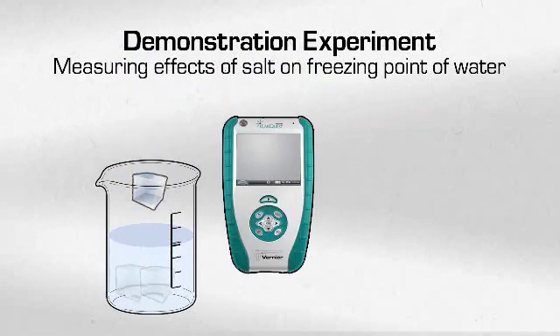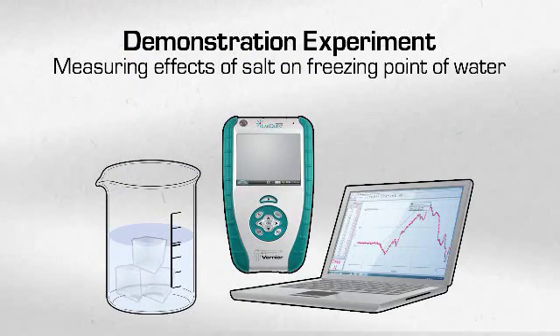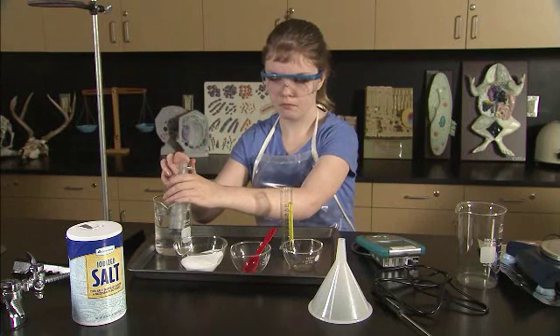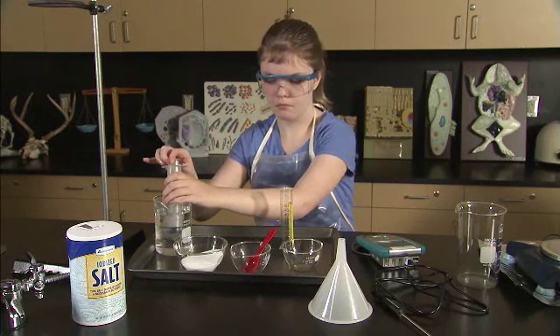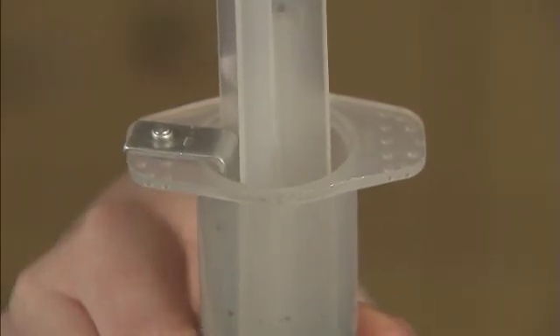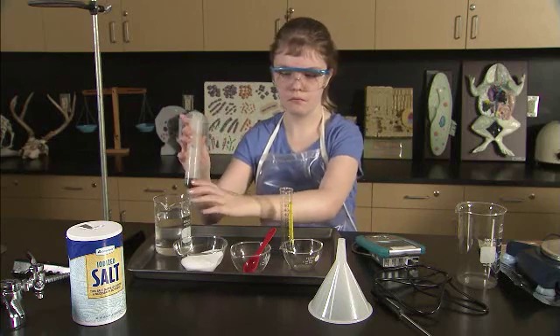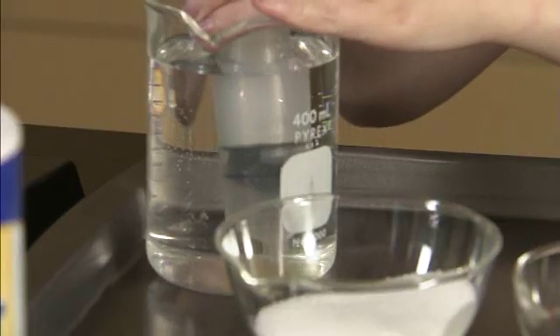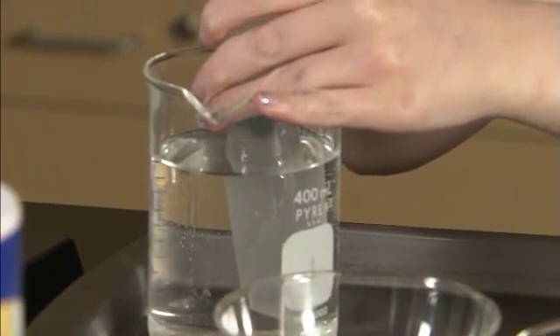She will then add ice to the beaker, and using the Talking LabQuest and Logger Pro, she will collect the temperature of the solution until it is stabilized. Aaliyah will first use a syringe to measure and transfer 50 milliliters of water from a full beaker to a smaller one. The syringe has been adapted with a metal bracket to stop the plunger at exactly 50 milliliters. For measuring other volumes of liquid, a syringe with notches along the plunger at various volumes can be used. Both beakers should be placed on the lab tray.